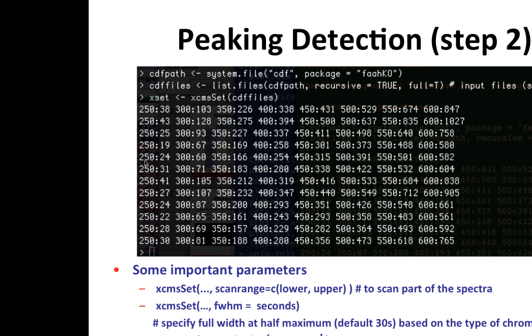So Jeff, would you recommend, say you've got your files, you run them through the defaults, looking at the peak list you get and comparing it to some of the raw spectra, just to make sure it's not missing anything or misidentifying anything? Yeah, we're going to cover that in the last step, just visualize some peaks. You really want to ensure they are real peaks, with high intensity and high confidence. Visualization is important. Some people suggest using two different orthogonal tools to double check whether these peaks are detected. The LCMS spectrum is quite noisy, so visualization is always a second check.